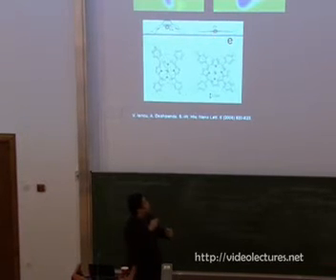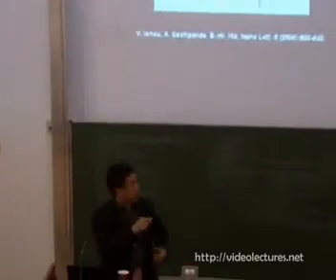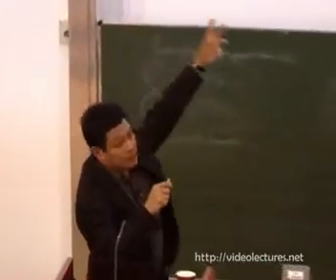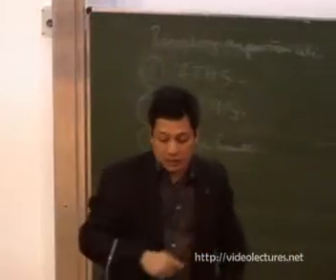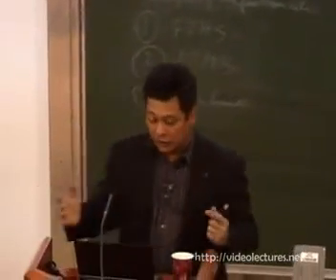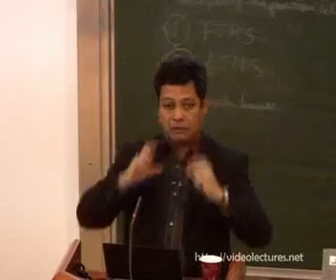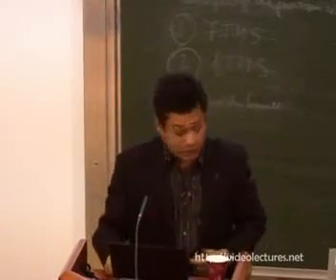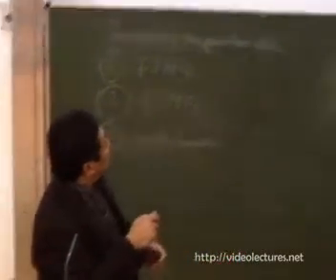One magnetic atom is in contact with the substrate, which has a bunch of free electrons. For another one, we can lift the magnetic atom, so we can reduce the contact with the free electrons. Now we can play around to see the spin-electron interaction, which means the spin from the magnetic atoms and the electrons from the substrate interact. And please remember that if we have two lobes, it's bent; four lobes is flat.